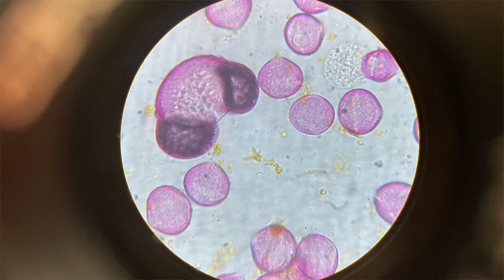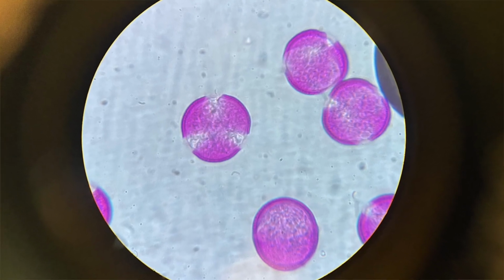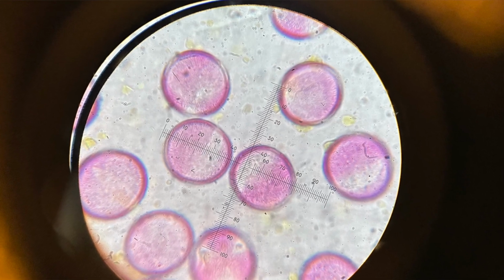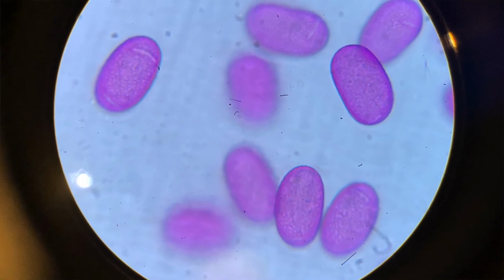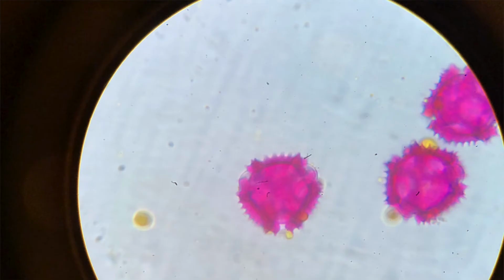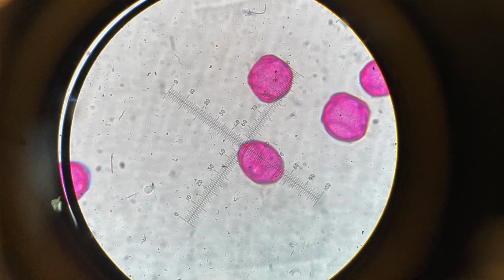So anyway, I do it myself. I love it. And you did have a chance to see a couple of my slides and you see the differences in pollen. Of course, the color, and when you look at those differences, don't think about the color. There's a colorant that we used in order to show the differences in terms of texture and the look of the whole pollen samples. So that's why they all look the same. They all have pretty much the same color, but there's a reason the pollen I collected was not pink, right? So that's the idea. I just wanted to make sure you get that.